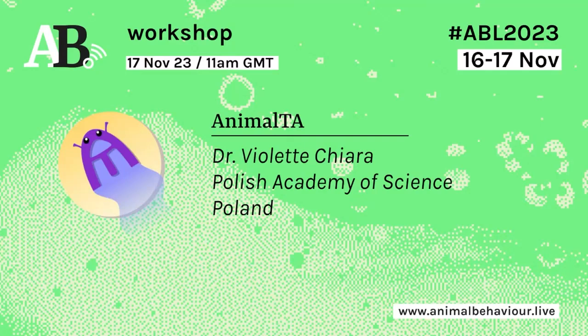So in her career she works on social behavior and collective movement, mainly on spiders and fish. And today she is not here to present her research, but something that is part of her research: a tool that she developed to track animal behavior in the easiest and most user-friendly way possible, a software called AnimalTA. So Violette, the floor is yours. You can present your software.